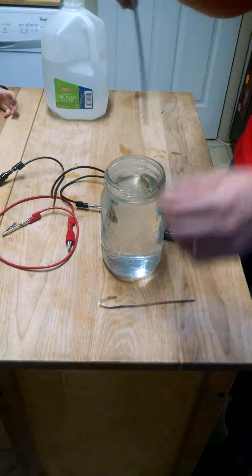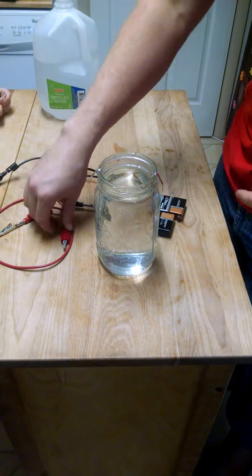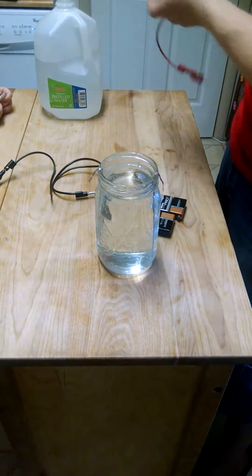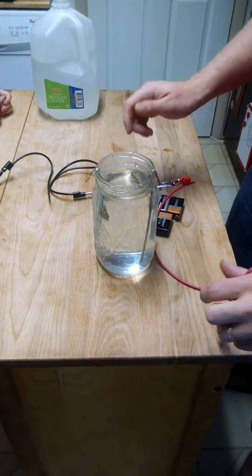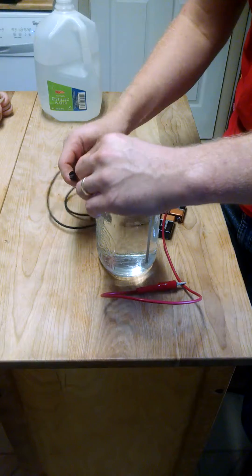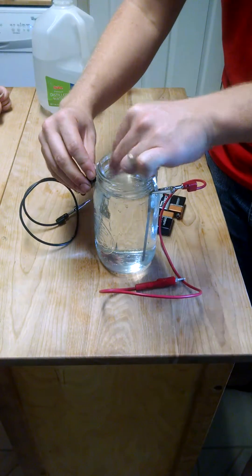And then all you need to do is place your leads in the water so they're not touching each other, otherwise you'll spark an arc and then it won't do the electrolysis. So you hook up black to one, red to the other, whatever color you're using.